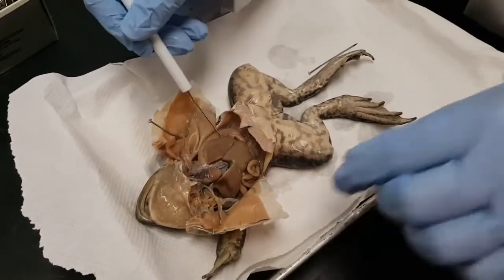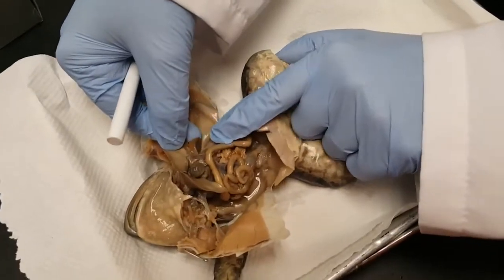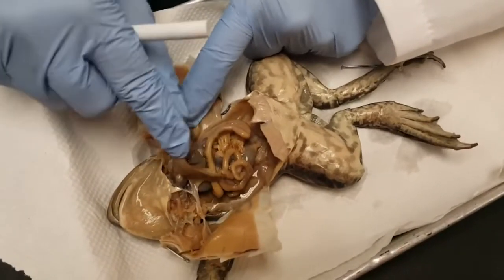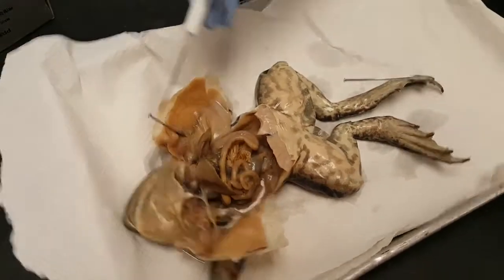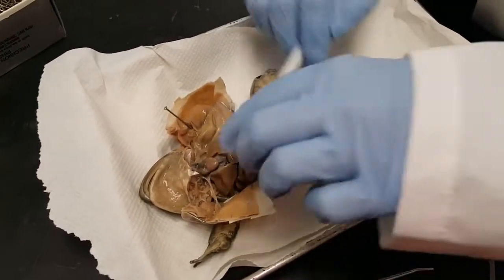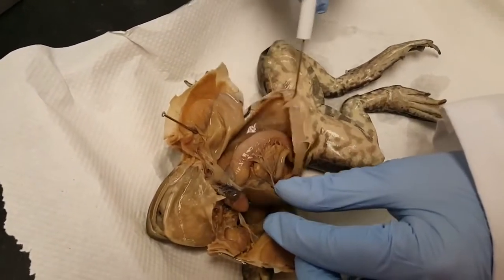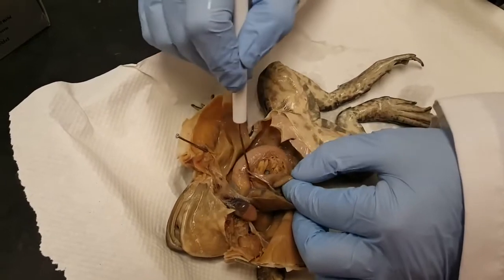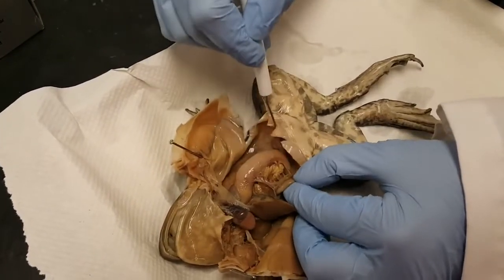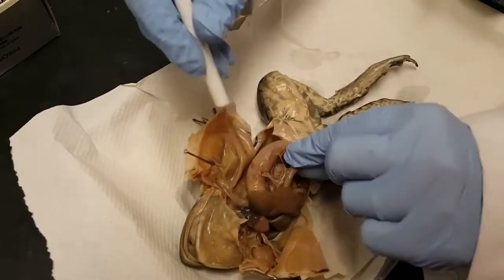Now the liver — if we raise the liver, right over here we find a structure that kind of looks like a booger. That is your gallbladder. And then if we go to the other side of the liver, we see this curved structure, which is the stomach. Now the stomach has a pancreas kind of on the inside of the curve, but in a lot of frogs the pancreas doesn't preserve very well — I don't really see it on this frog.